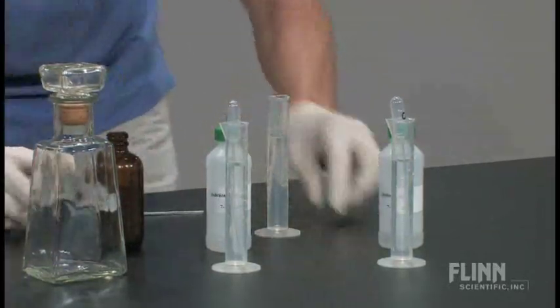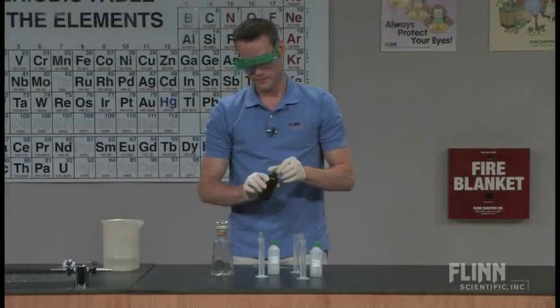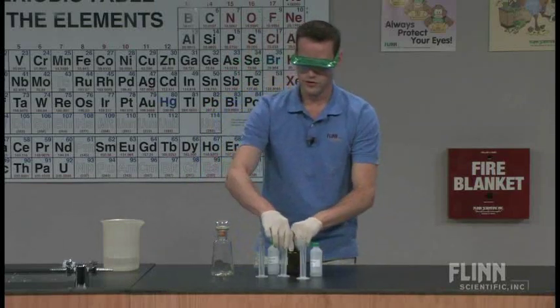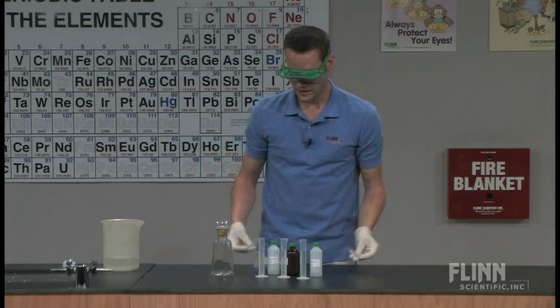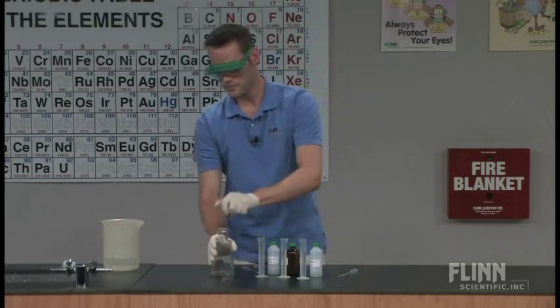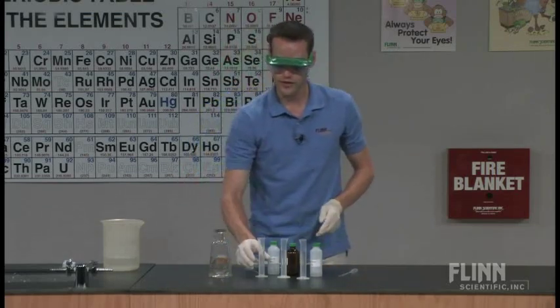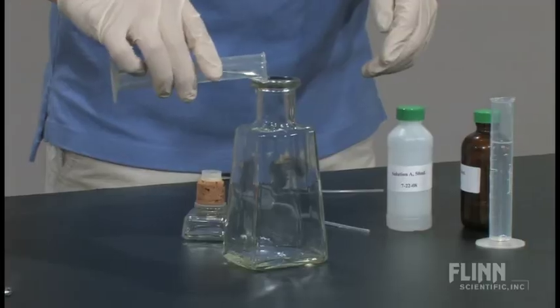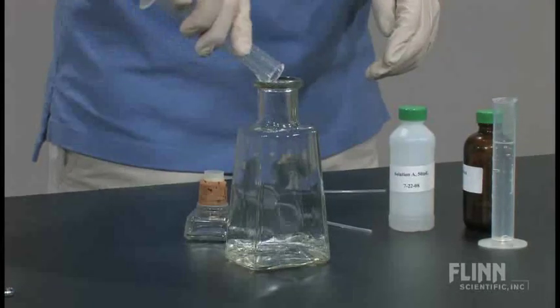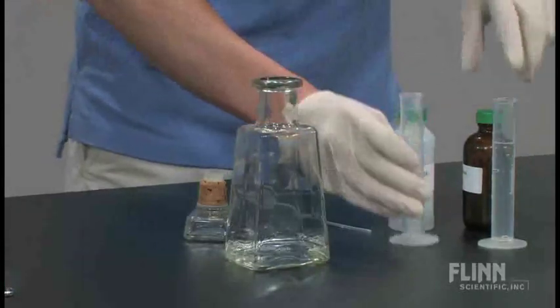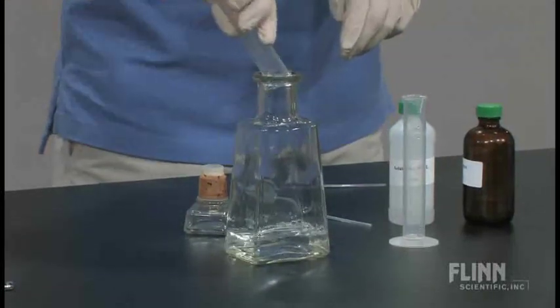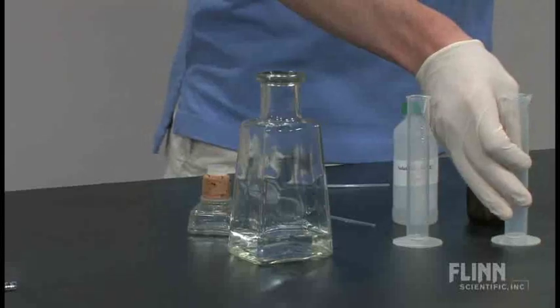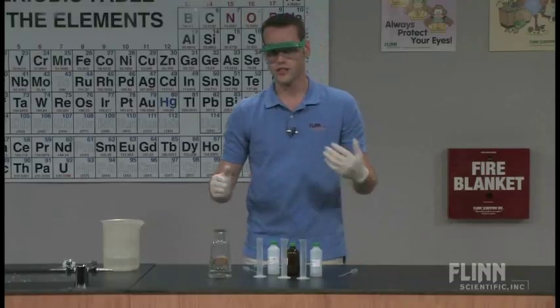So I just need to pour out 25 milliliters of solution B. So I have 25 milliliters of each solution. Now I also tell my students it's very important to go in order. Solution A goes in first, solution B goes in second, and then solution C is the one that starts the reaction. So don't put in C until you're ready to go.